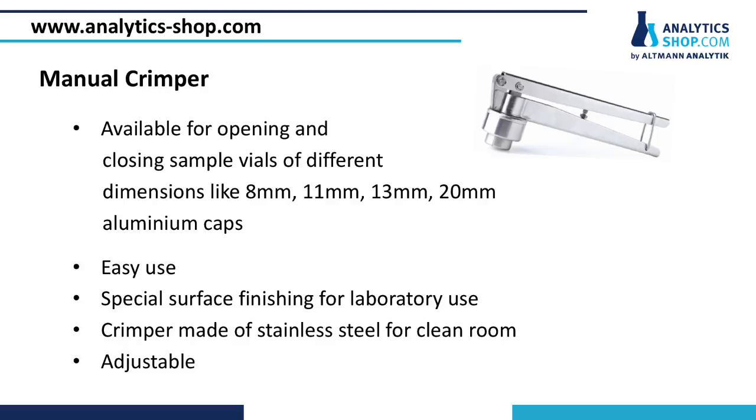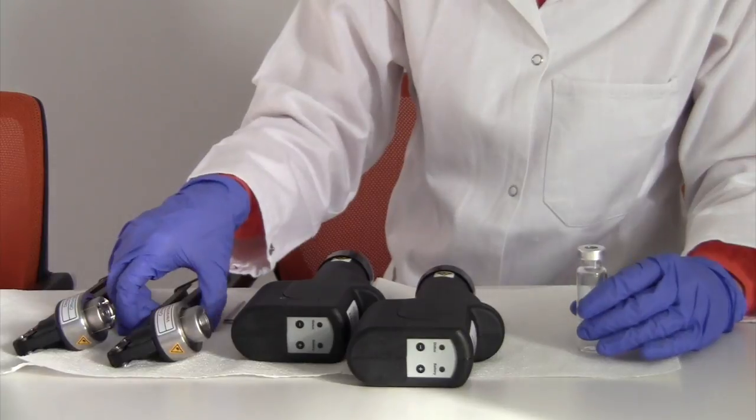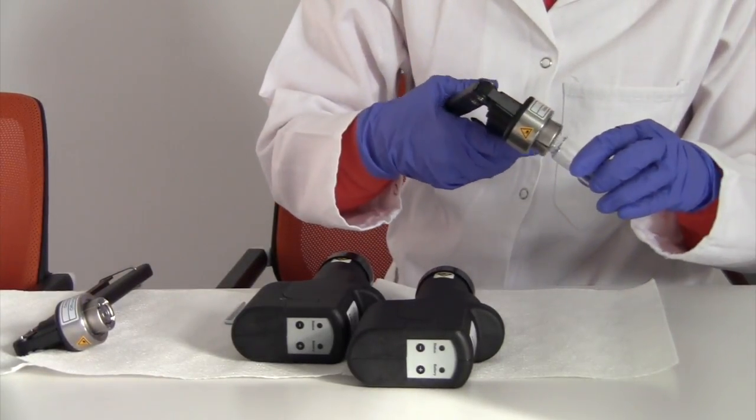In order to optimize the crimping result, an adjustable screw can be adopted. As an example, I demonstrate now how to crimp a headspace vial. First, the loose cap is set on the top of the vial. Take the crimper and press.